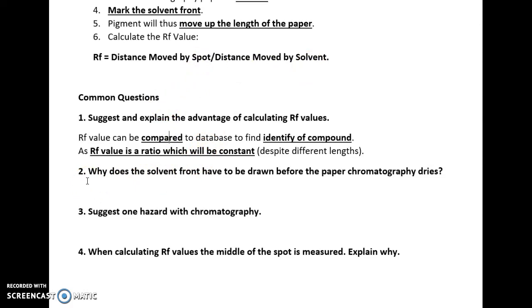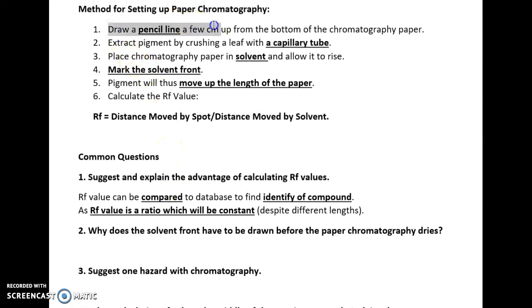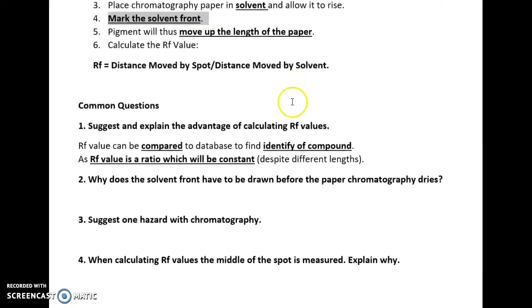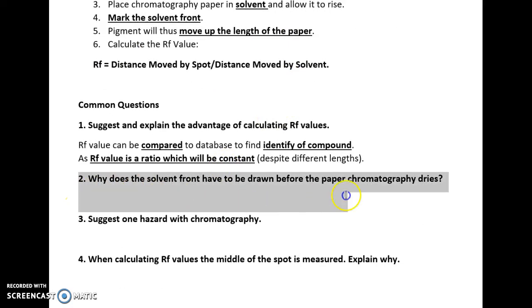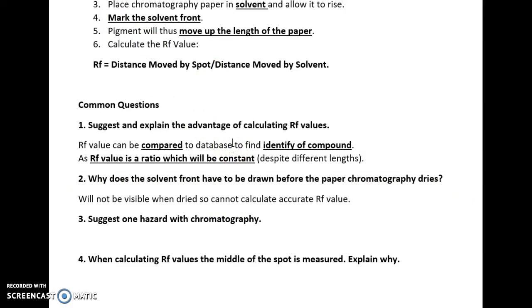Why does the solvent front have to be drawn before the paper chromatography dries? If we wait to mark it, the solvent will not be visible when dried, so we cannot calculate an accurate RF value. Because of that, the ratio will not be what it should be and therefore we might not be able to identify the compound.